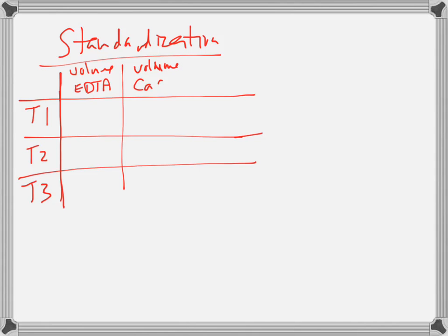Volume of our calcium carbonate solution. As an added bonus for each of these, you should be including units. You can either include the units, like I am, super crammed up at the top, or per each number, you can write it next to each number.